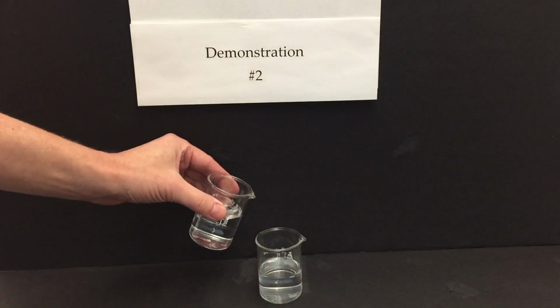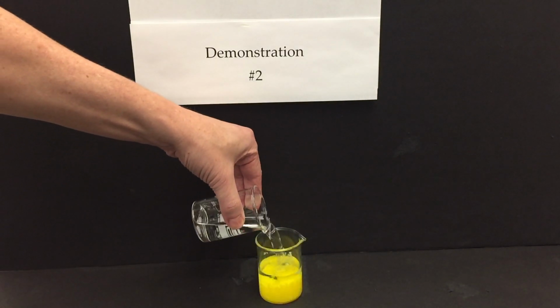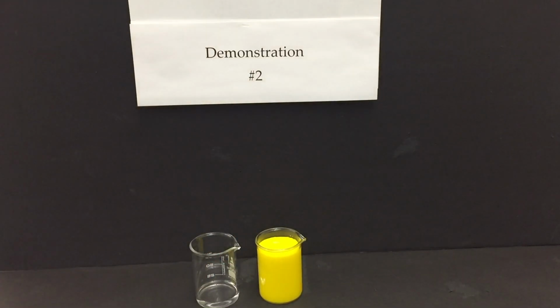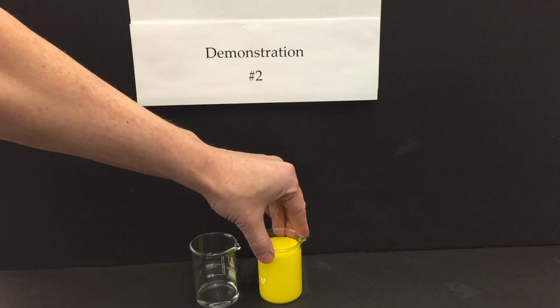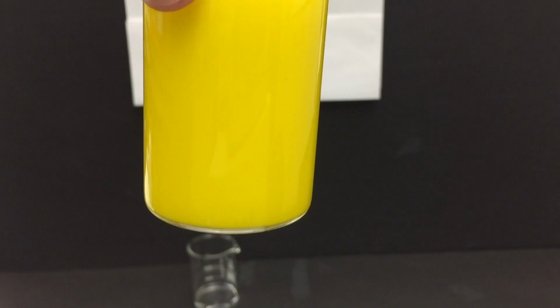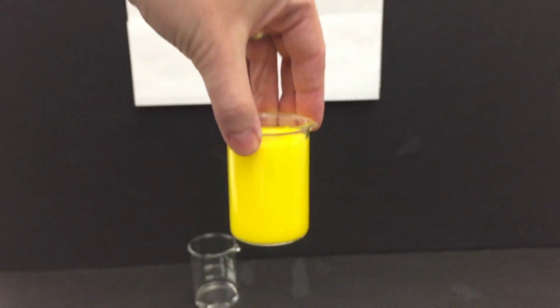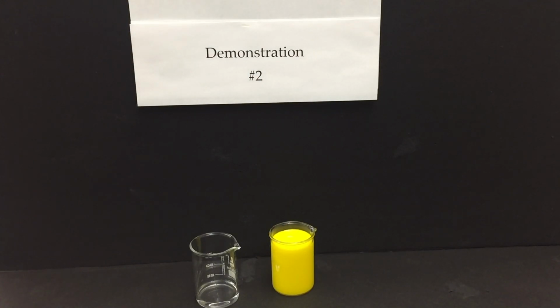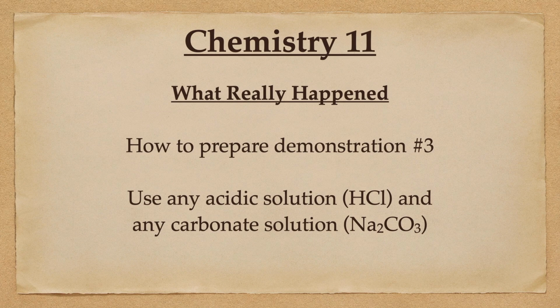Once again, when you pour one into the other, ask them, when did it change color? When it hit the top of the water or the bottom of the water? After time, the lead iodide solid will settle to the bottom. Initially, it's uniform. After half an hour, there will be definitely layers to be observed.